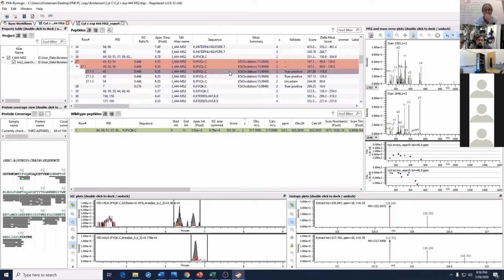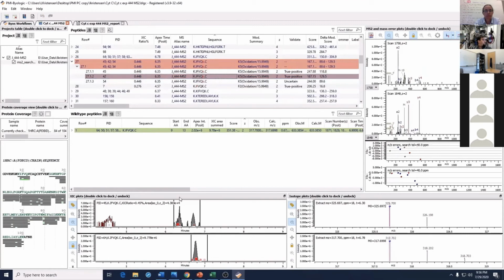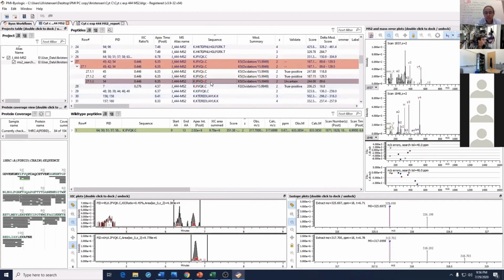Let's look at another peptide modification. Here we have a small peptide with a lysine modification, and 3 peptides were identified for this particular modification. The first 2 peptides are associated with the first peak right here. However, the third peptide has a retention time that puts it in the second peak here, which is a little suspicious. If we look at the fragment ions that were identified for the third peptide, we see that we don't have great coverage for the glutamine and the lysine residue.